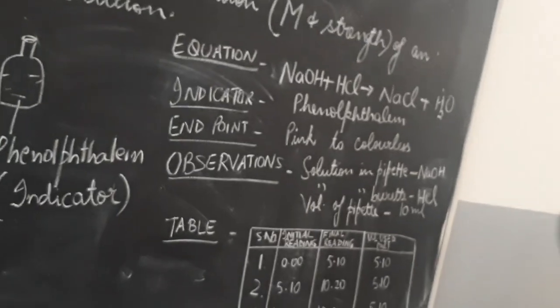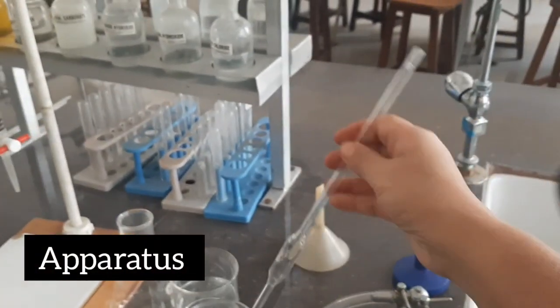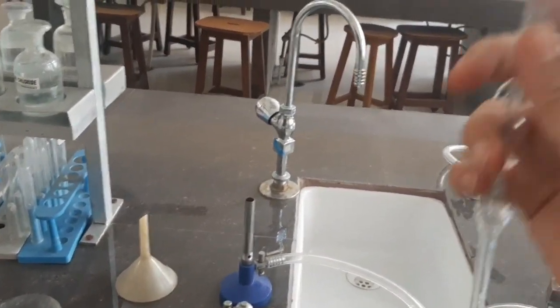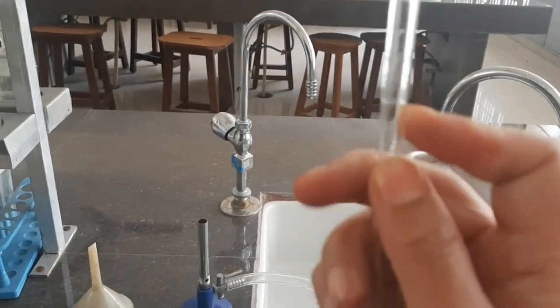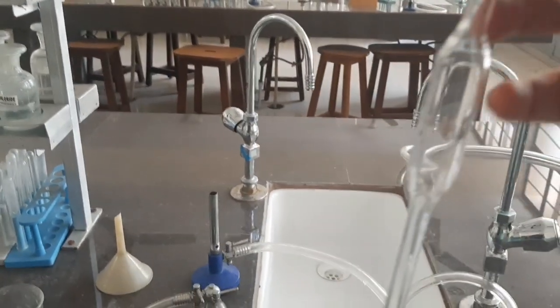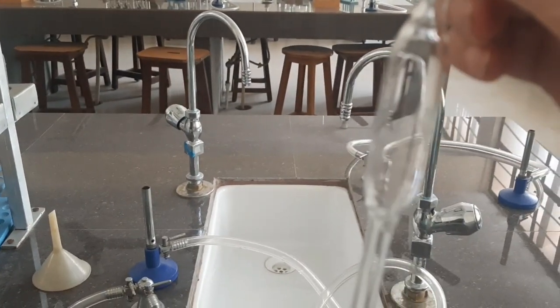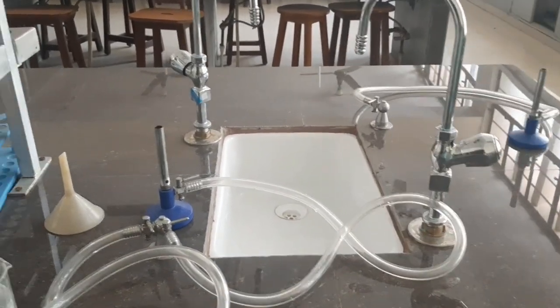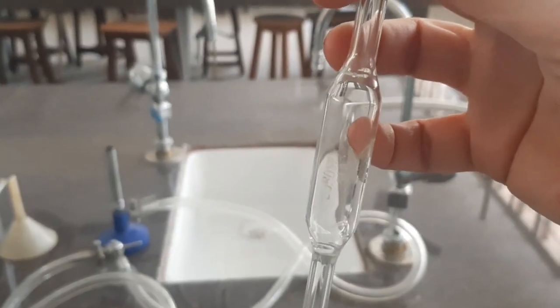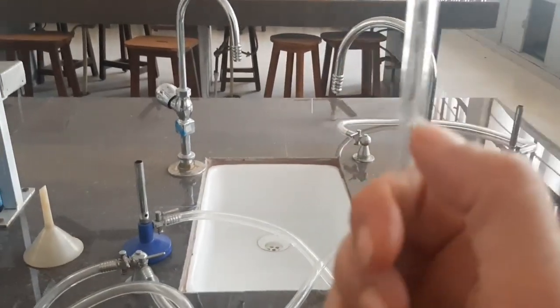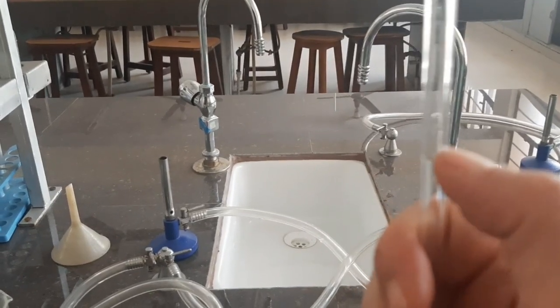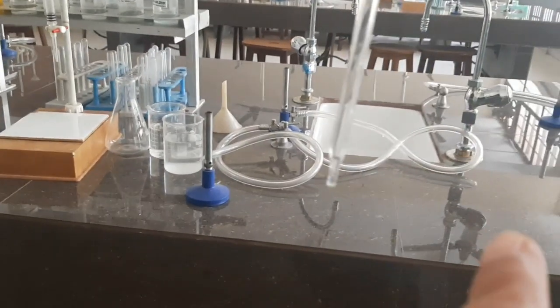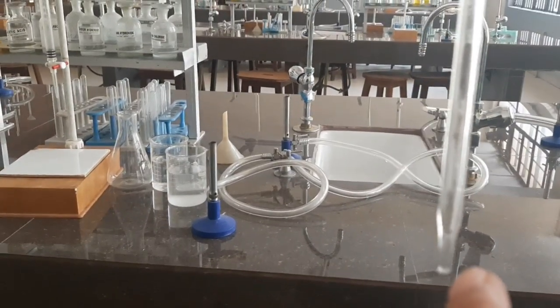Let me introduce you to the apparatus. This is a pipette. As you can see, it has a graduation mark at one part and a bulb. On the bulb is written the volume — the volume of this pipette is 10 ml. This means that if we fill liquid in this pipette up to the mark, it will be exactly 10 ml. This end is a pointed end, and before you start working with a pipette you must check that this end is not broken, and neither is the top chipped in any way.